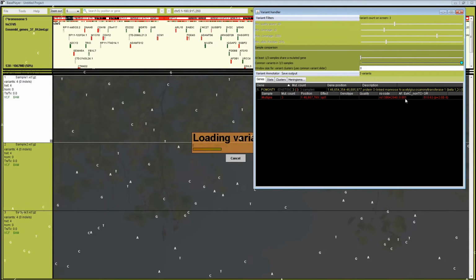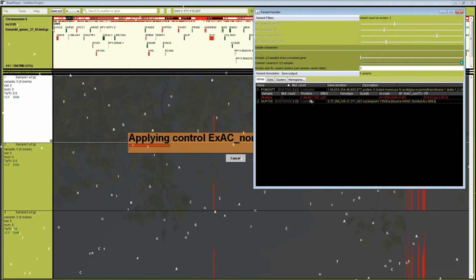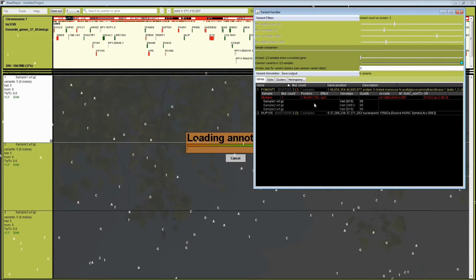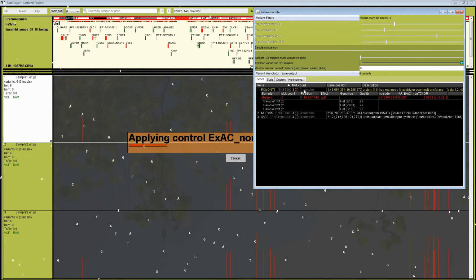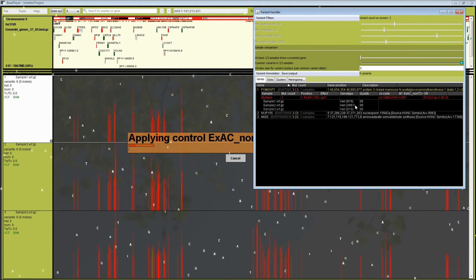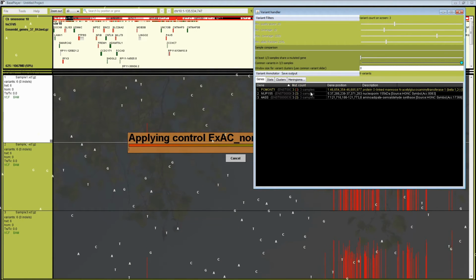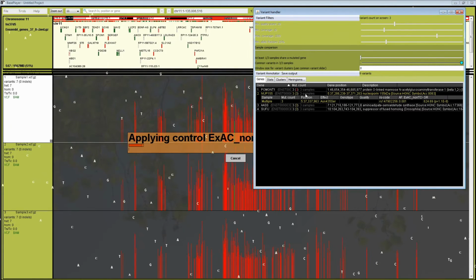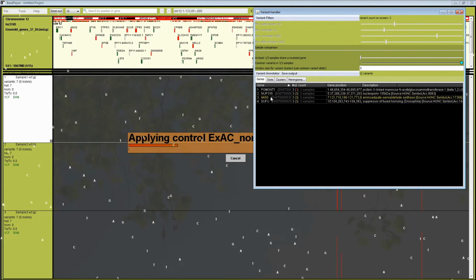And in this column, we can see the allele frequency for the control file and the odds ratio with the p-value. And I can expand this and I can see how many samples shared this variant, and it appears in all 3 samples, but that really isn't surprising because we had changed the common variant slider to 3 out of 3. And while we're waiting for BasePlayer to complete all the chromosomes, we can already start looking at some of these. And they seem to be in the control files.